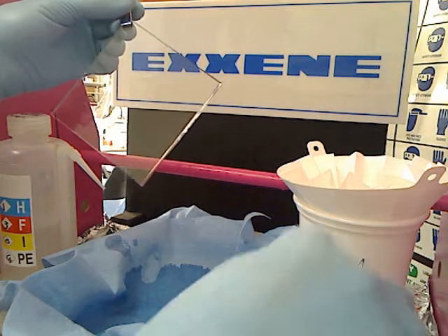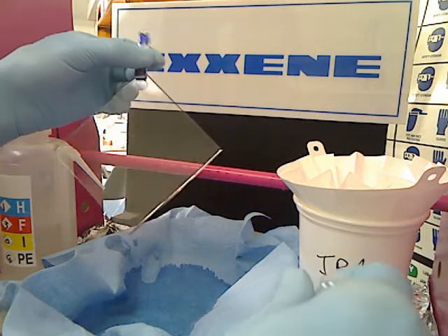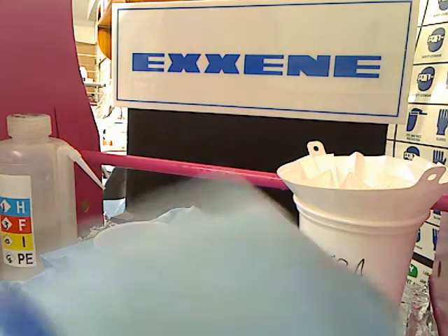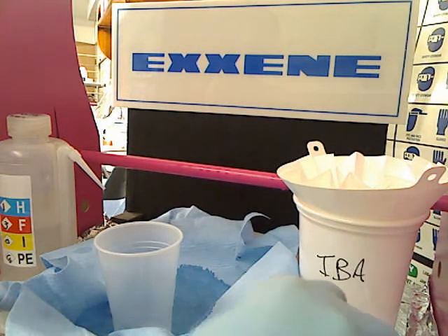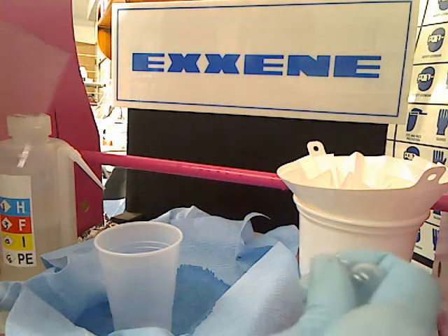Here we have the slide that we cleaned off earlier, and what I'm going to do right now is a basic flow coat application with a 5 milliliter pipette. First thing I want to do is set up a drip capture cup — in this case I'm just going to throw it away. I use polystyrene. Some polystyrene cups will melt with certain coatings, so just be careful with that.